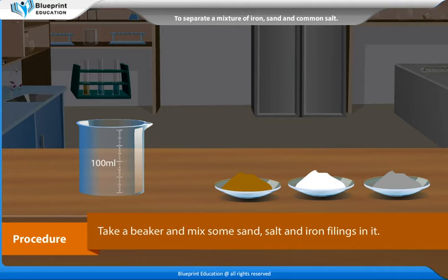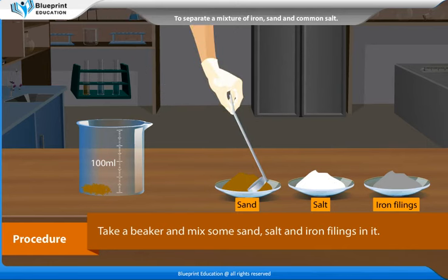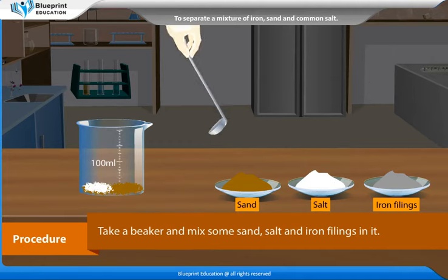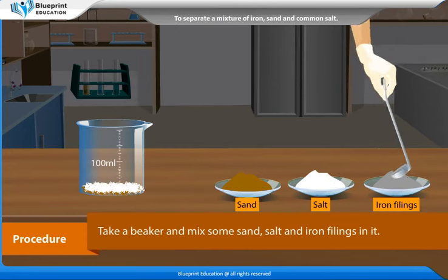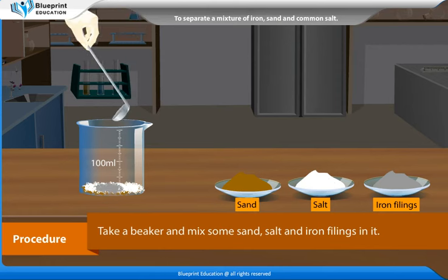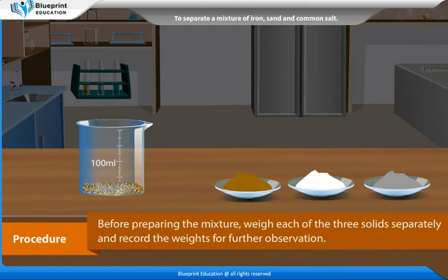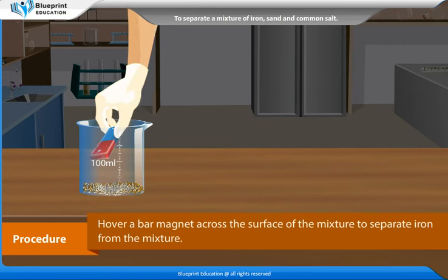Procedure: Take a beaker and mix some sand, salt and iron fillings in it. Before preparing the mixture, weigh each of the three solids separately and record the weights for further observation.